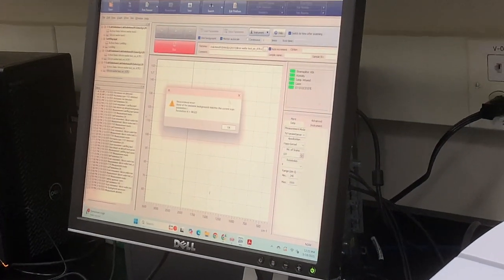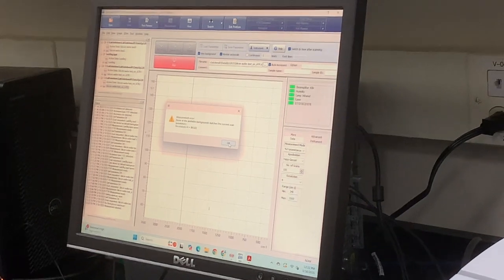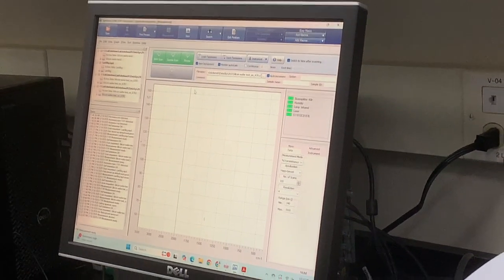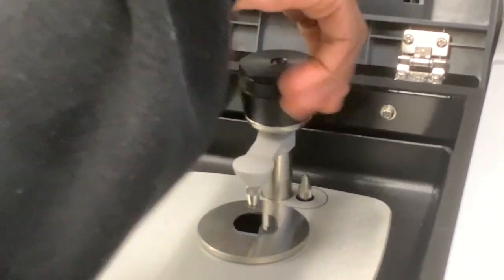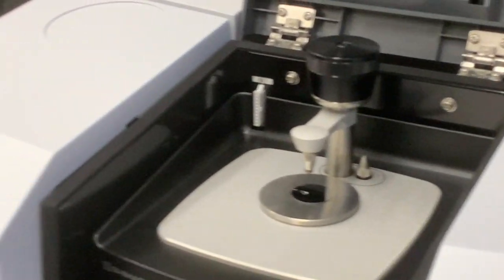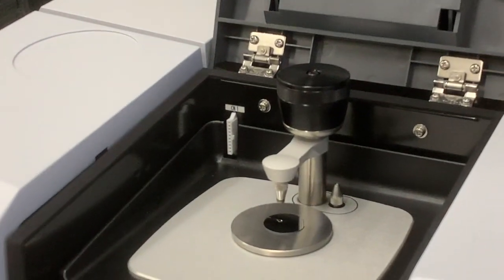So the scale is from 0 to 100. When I see a profile, in specific wavelengths, I just say that it's around 40% being transmitted. So it means that 40% is transmitted and 60% is being absorbed.